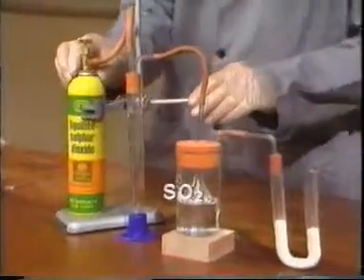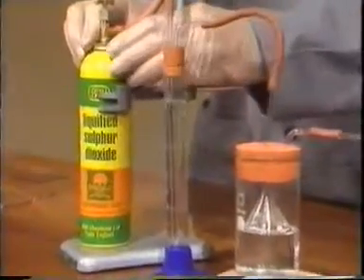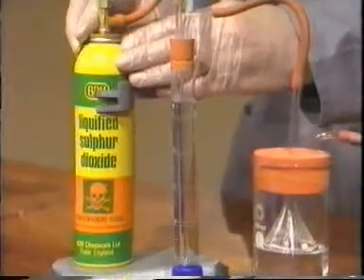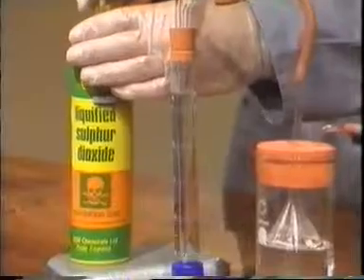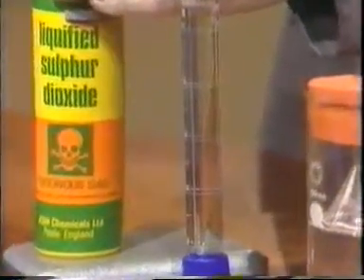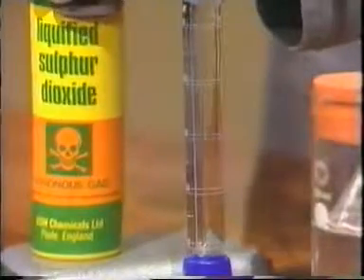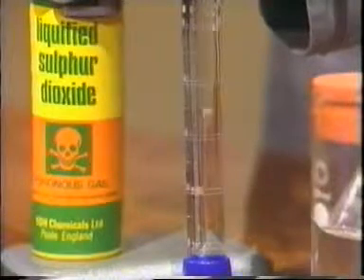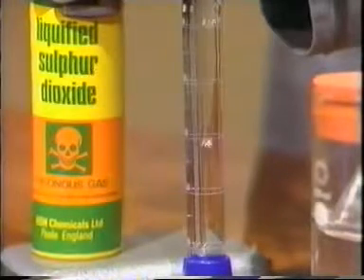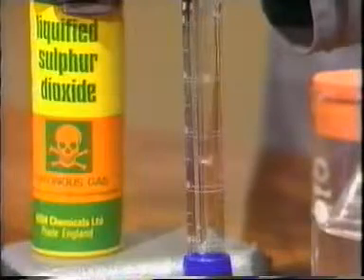and this is a very toxic gas, so we have to be careful how we handle it. I've got a cylinder here of compressed liquefied sulfur dioxide, and I'm going to bubble some of the gas into this tall cylinder of water connected to a gas trap. Now watch when I open the tap. The first few bubbles is just air coming from the connecting tube, and they're passing straight up the cylinder unchanged.